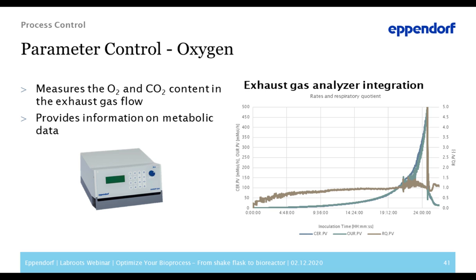Real-time off-gas is an important tool for gaining insights into a fermentation process by allowing the user to examine carbon evolution, oxygen utilization, and the transfer during the fermentation. This information can be used to find changes in metabolism, spot potential problems, and trigger changes in the fermentation process. Through off-gas analysis, insufficient oxygen or substrate supply can be identified.